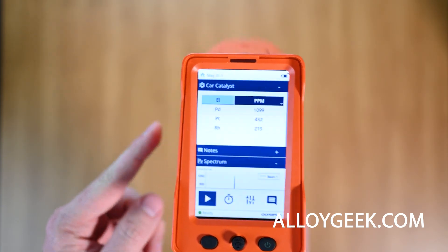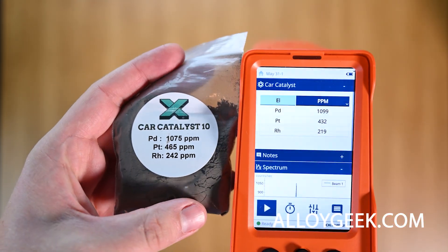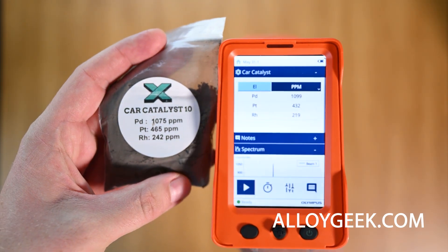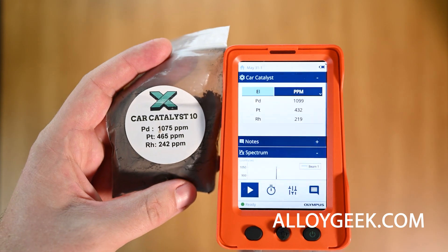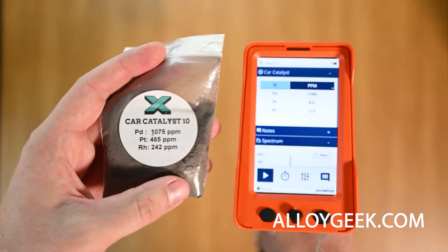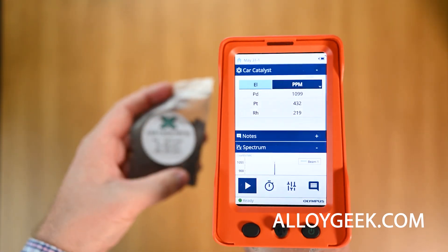Now, it's important to compare this to a reference material and see how close your analyzer is reading. In this case, we're pretty close, but I'd like to see this analyzer a lot closer than these results. To get closer, use a longer test time and better setup, just like we showed with the sample cup.